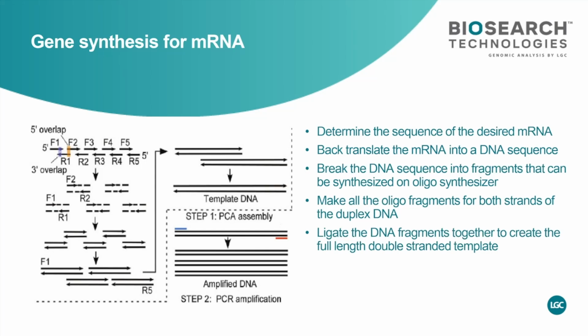But back to the gene synthesis template for the mRNA. The way you do gene synthesis is you take your full sequence and cut it into shorter fragments that are manageable to make. Then you do a second strand, which is the antisense strand or reverse strand, with little overlaps, cut in different positions. So when you're trying to assemble the gene right here, this is going to be your forward oligos, and those are going to be your reverse oligos.